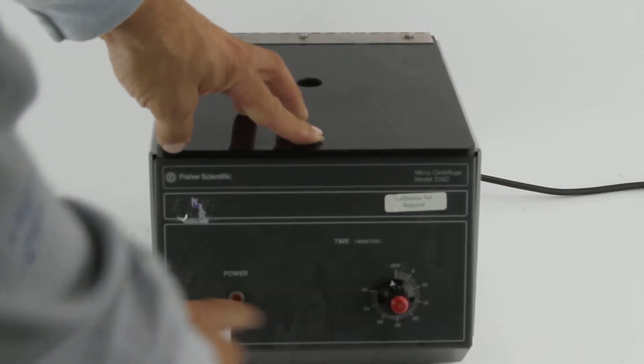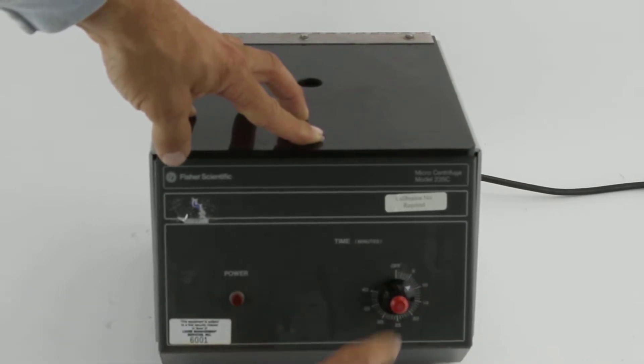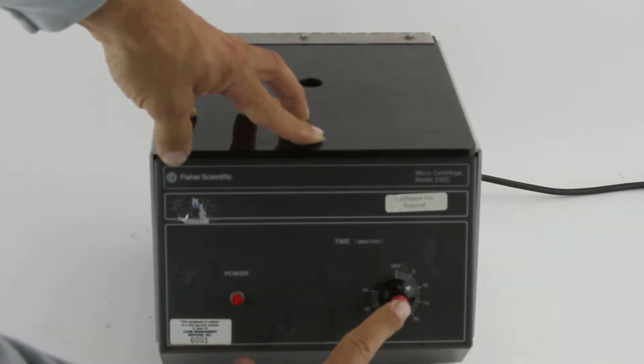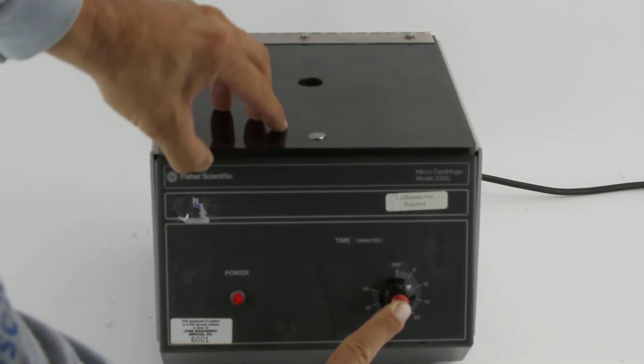Here's your power light. You're gonna see this turn on when I adjust the time and press the button. The light goes on and basically stays on.